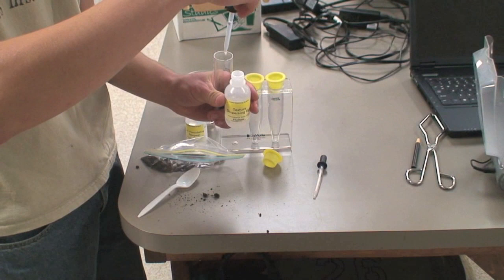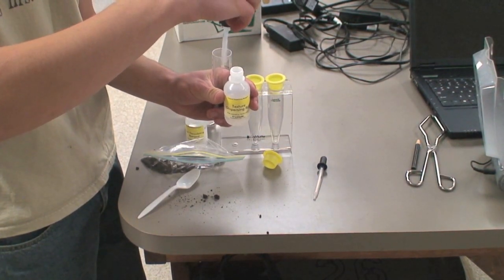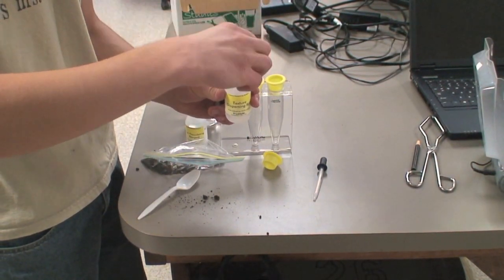Add one milliliter of texture dispersing reagent to the tube. You may find it helpful to use the supplied dropper.